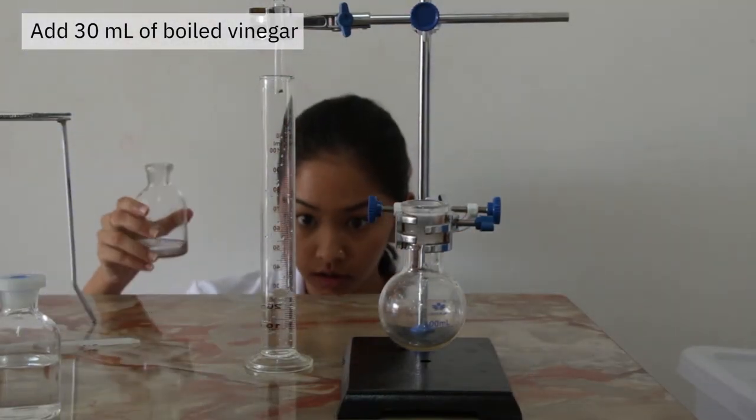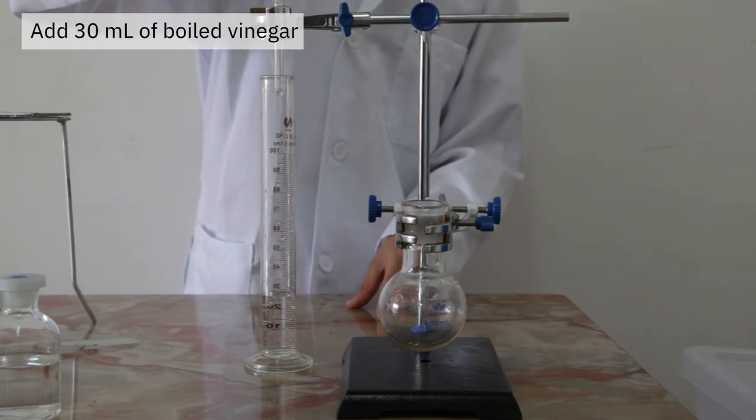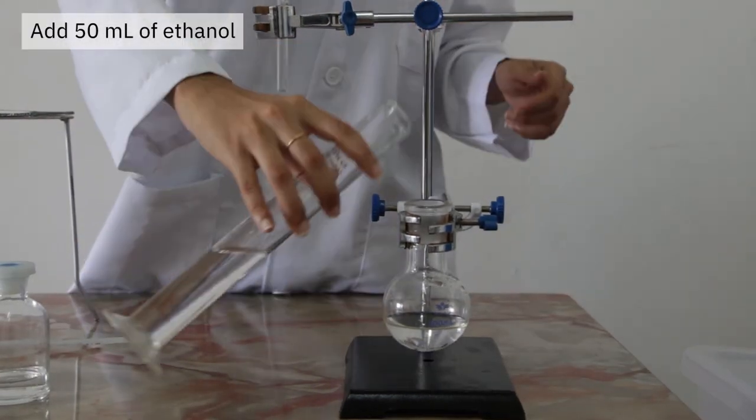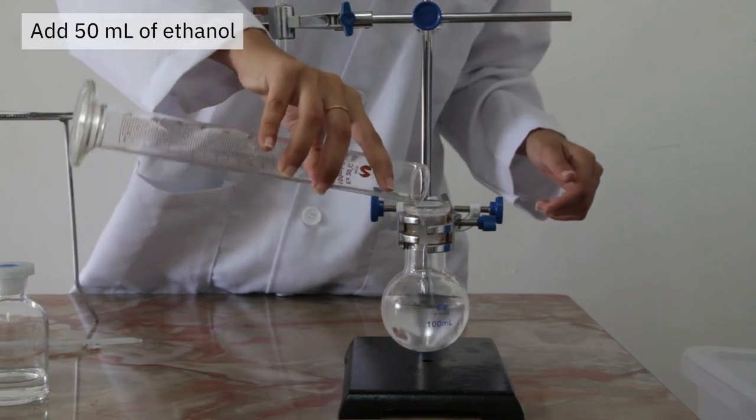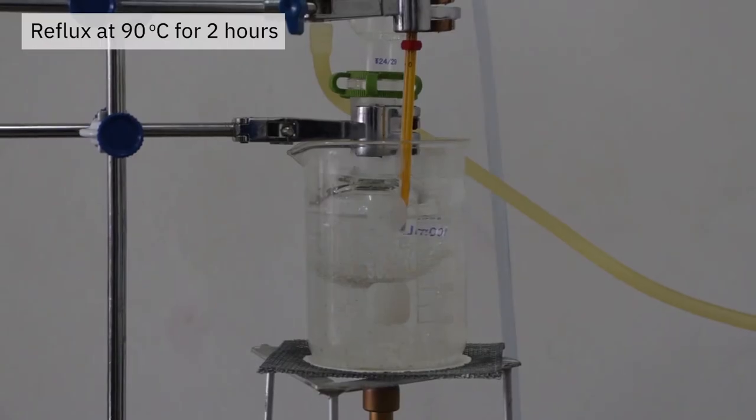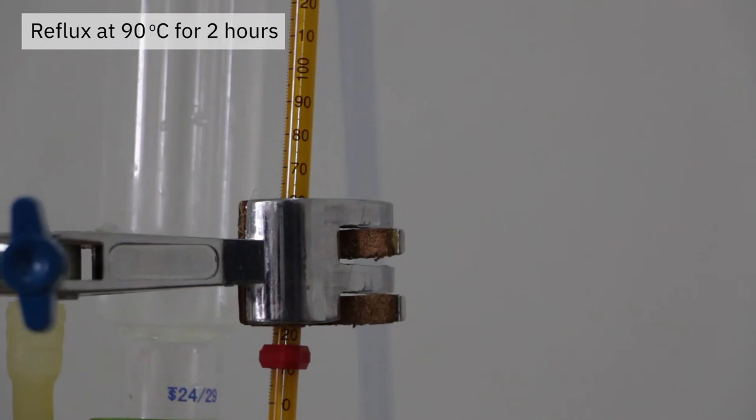30ml of the boiled vinegar solution is measured and added to a round-bottom flask. Then, 50ml of the ethanol solution is added too. The reflux apparatus was set up as shown. The water bath is heated and the temperature is maintained at 90 degrees Celsius for 2 hours.